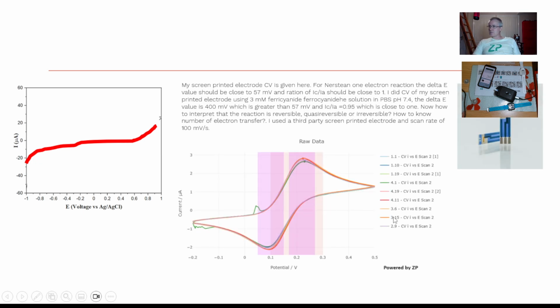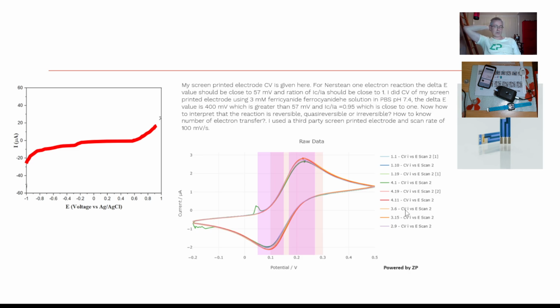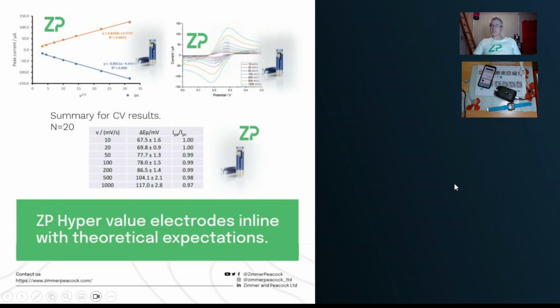This is some data from ZP. I don't know why I put a picture of a gold electrode up here. Probably just tiredness and trying to get to a deadline, let's say. But I actually think this data was for a carbon electrode. That said, we're not perfect either. I think the peak-to-peak separation in this particular one was approximately 150 millivolts, which is better than the 400 millivolts. But I'll talk about how to improve that. In fact, I talk about how to improve it here.